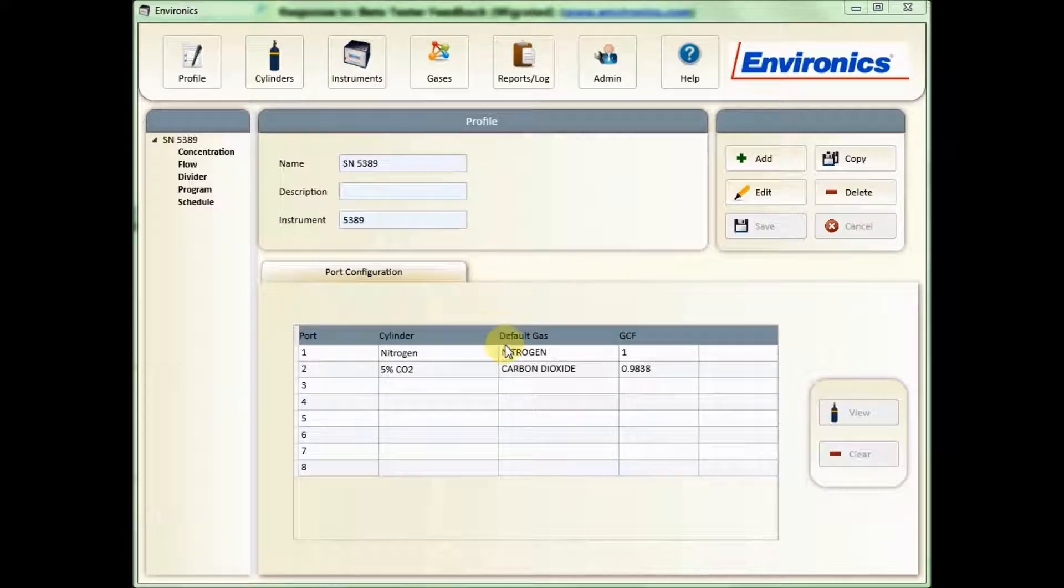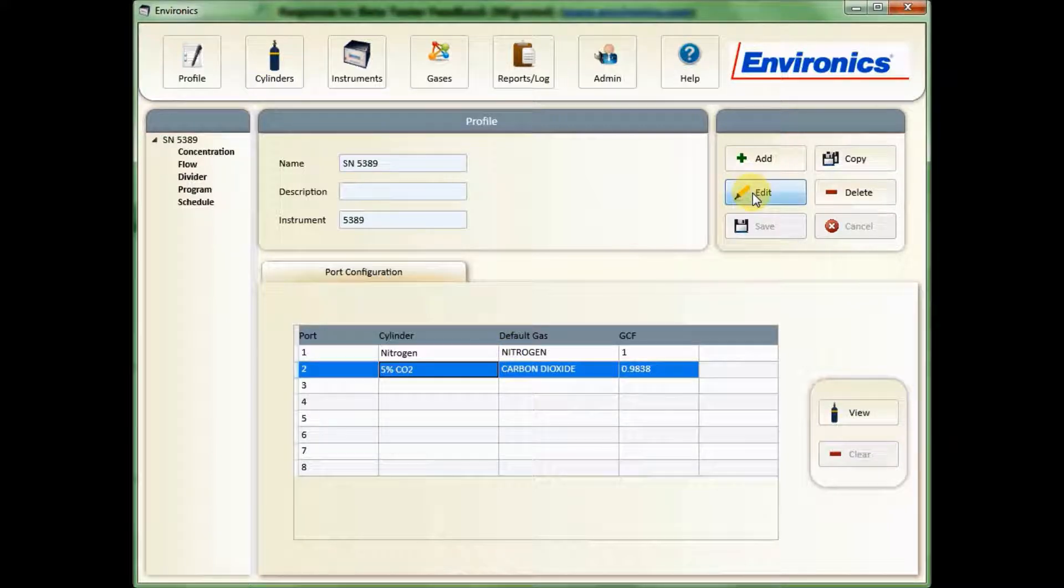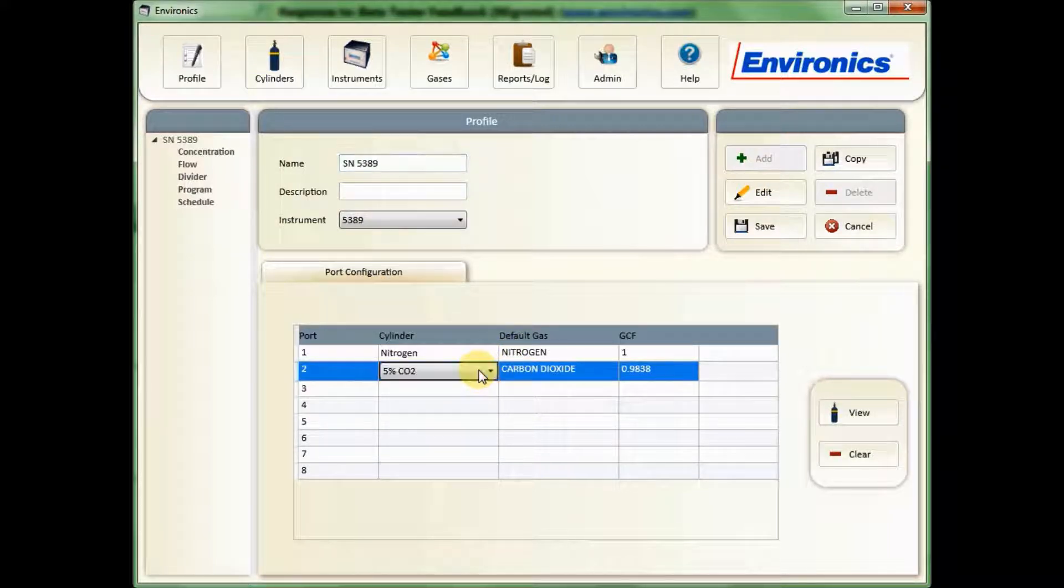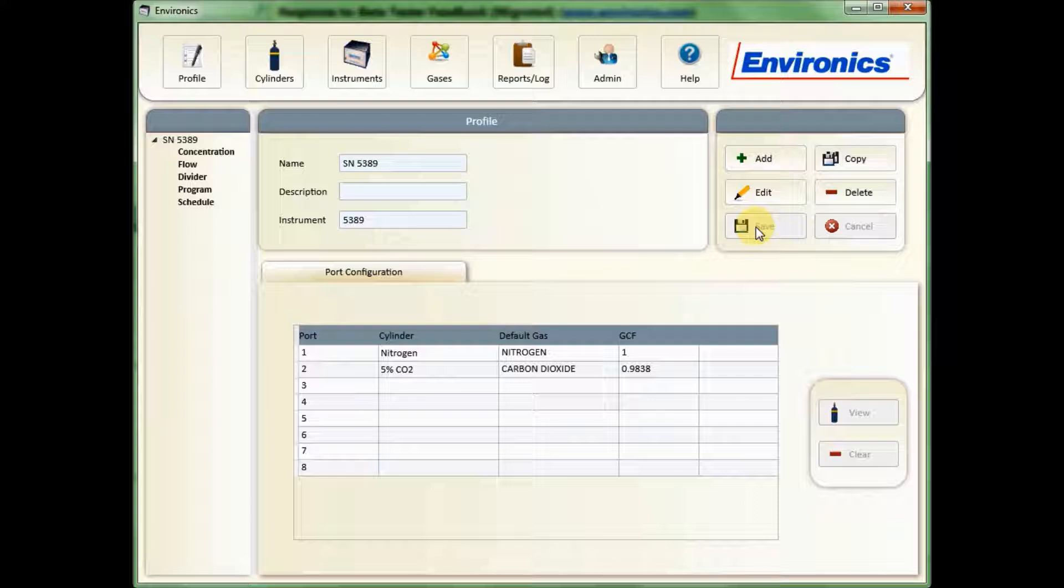Also, if you're looking to edit the profile, for example, to change the gases, you need to click on Edit, and then you can double click on your cylinder to change that to a different cylinder to move them around. And then just click Save again when you're finished.